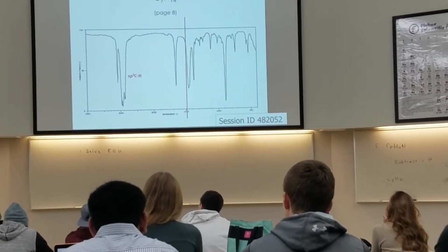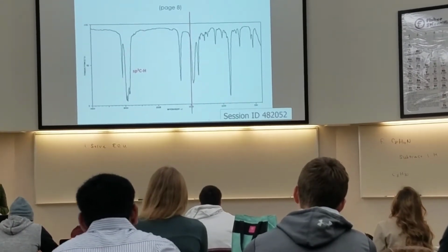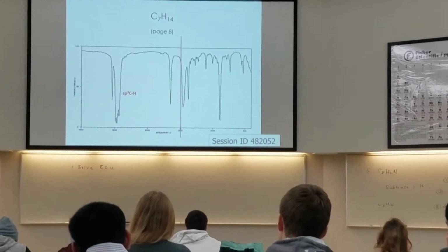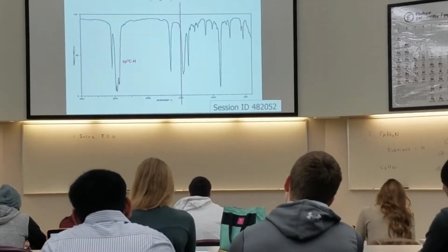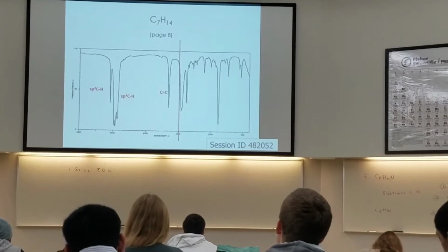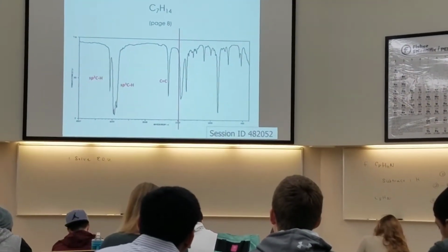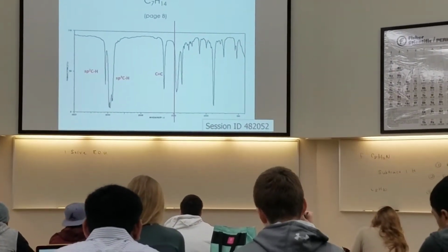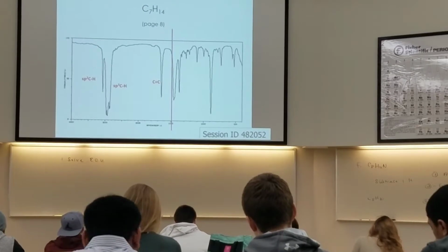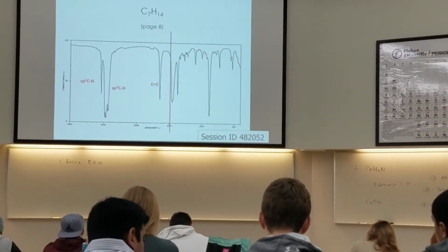So do we have a carbon-carbon double bond? Where's the peak for that? Or where's the peak that you would look for to know whether you have it? 1600, good. So that's, well, there's one on that side too, but that's the carbon-carbon double bond in the middle. And then you can use the one on the left to confirm that you really do have a carbon-carbon double bond, that you really do have an alkene, because then you have an sp2 hybridized carbon.